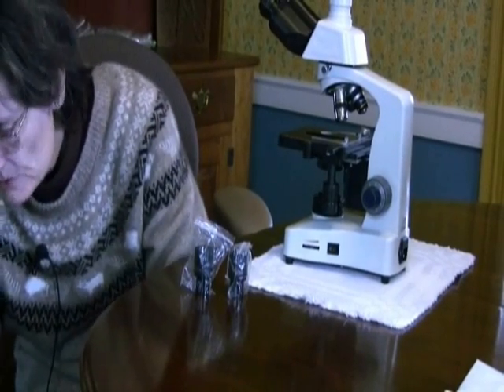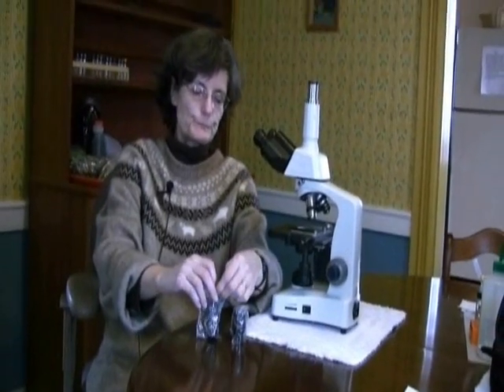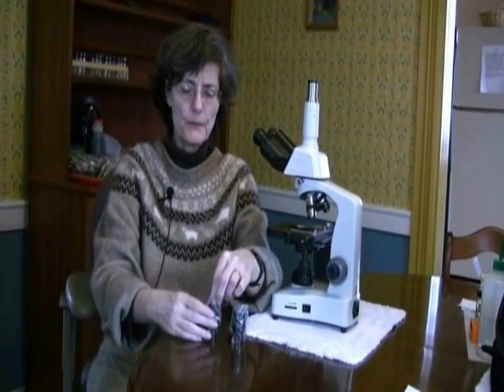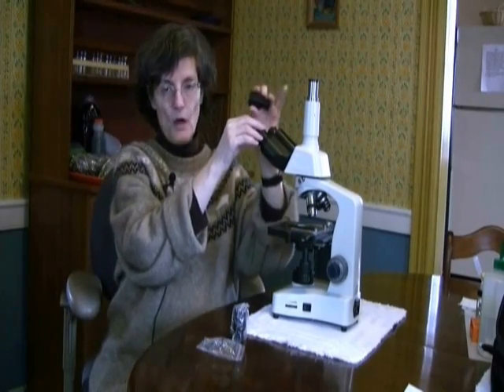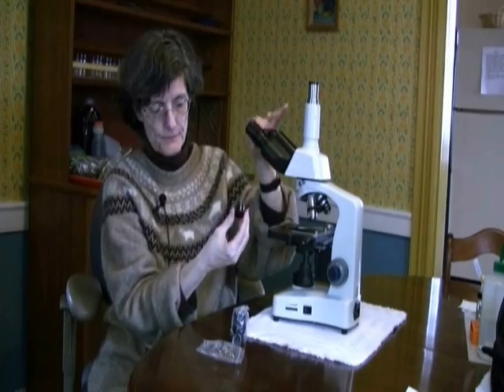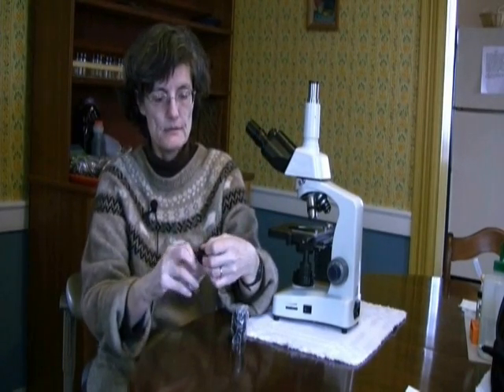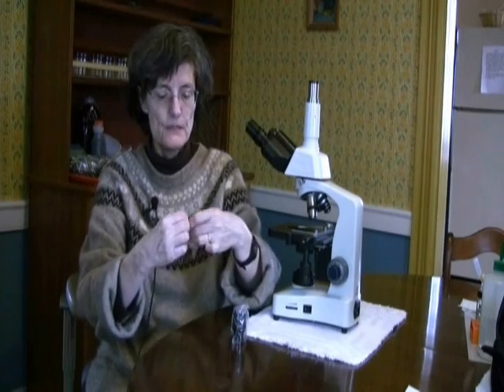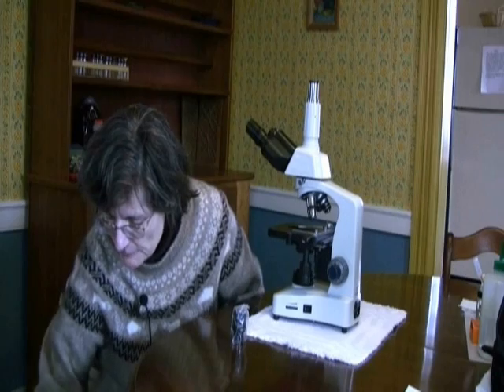So I tend to just leave them in the case. They really aren't necessary, especially if you want to be comparing your results to somebody else. Use the 10x eyepieces. All you have to do is pull the cover off and slide the eyepiece in. Now make sure you keep hold of that cover because, of course, if you ever go traveling, you're going to want to have that cover to protect things. So just put it right back in your microscope carrying case where it came out of.